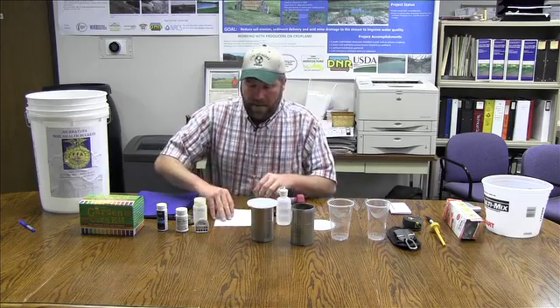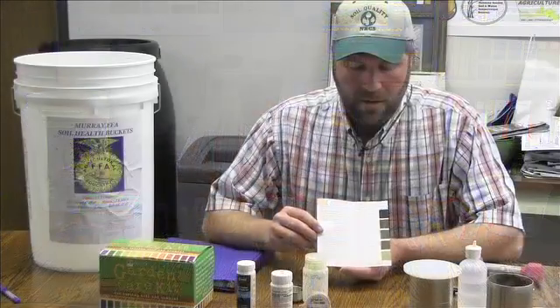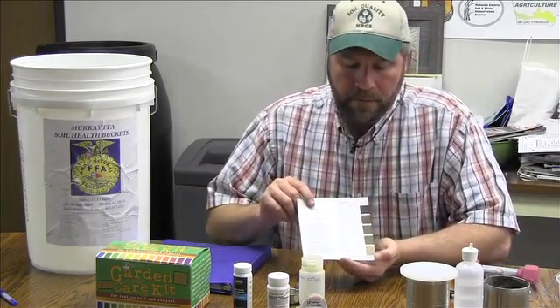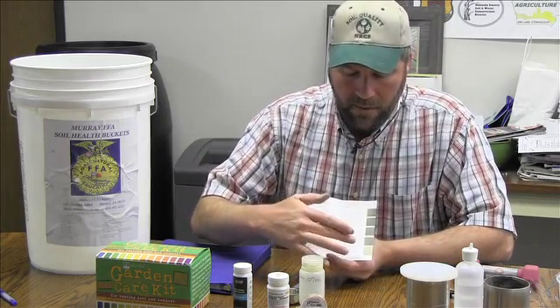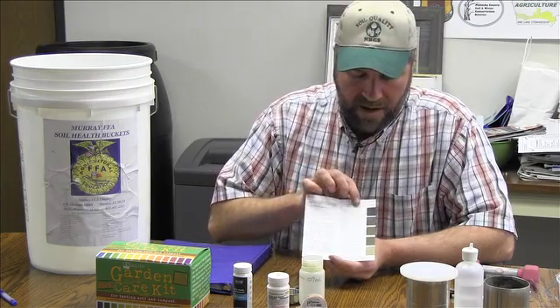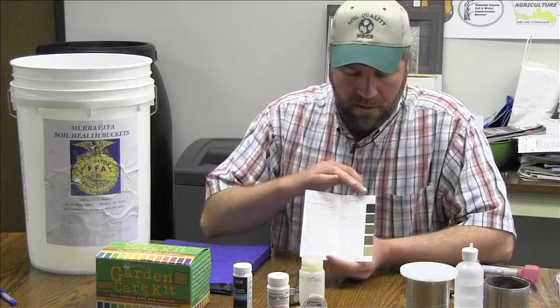For the last physical property, there is a color chart — an organic matter color chart similar to the Munsell color book. The ranges go from a low range of organic matter at the bottom to the highest range of organic matter at the top. You can see it goes from a light brown to a dark black.